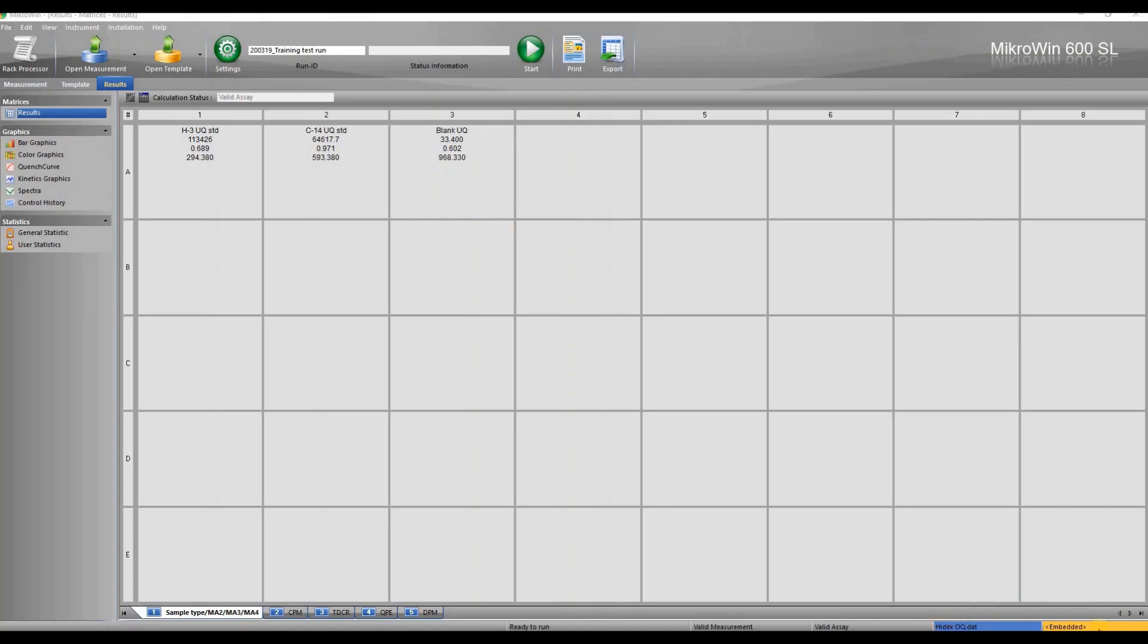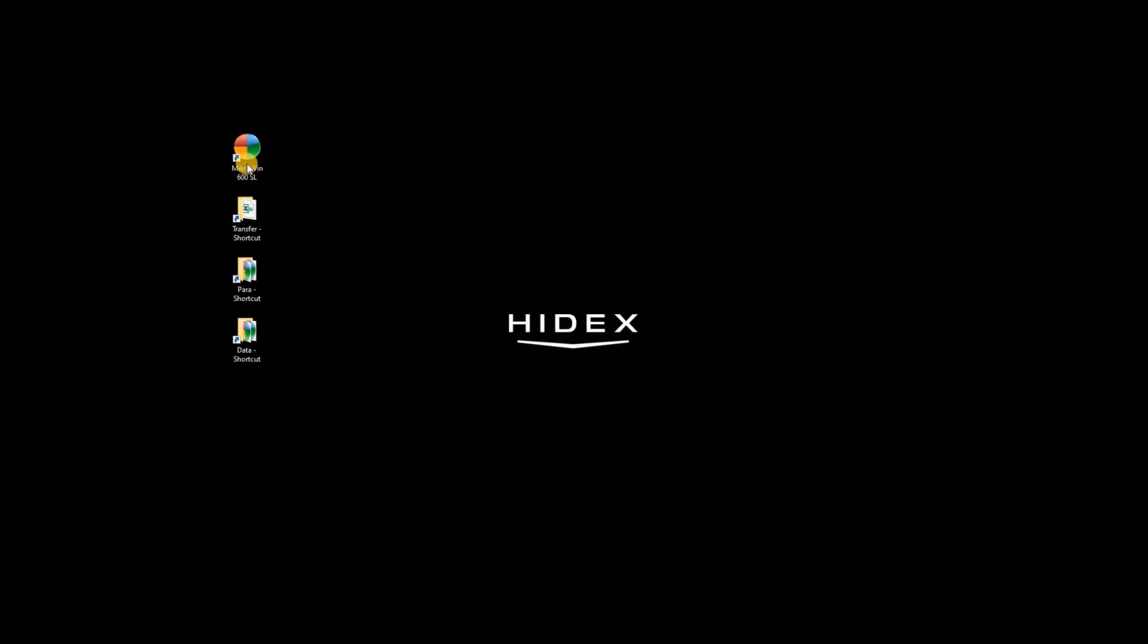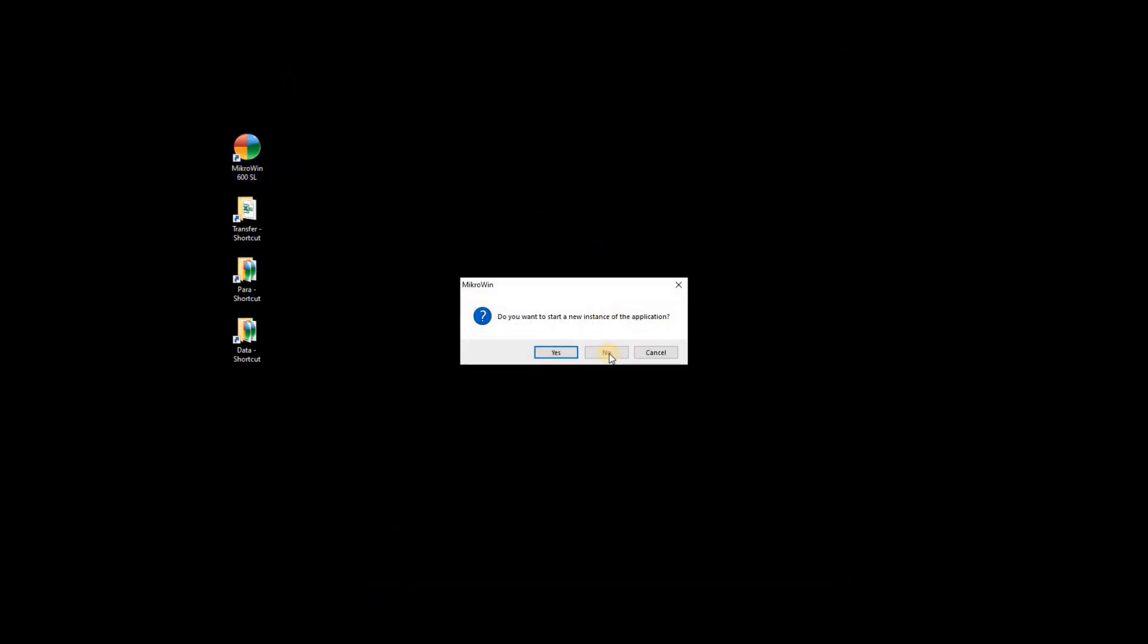While Microwind is running it is possible to open another instance to look at data or edit templates.